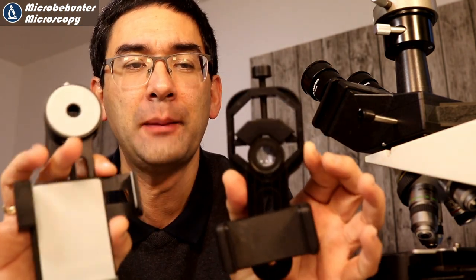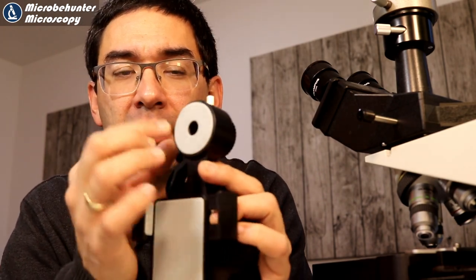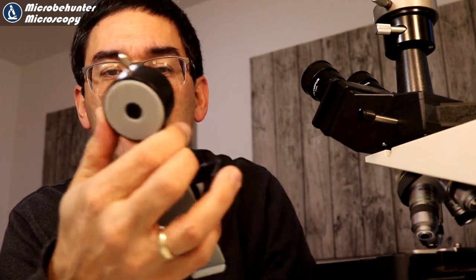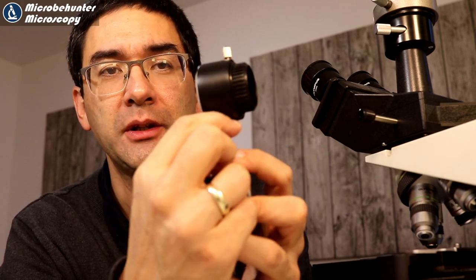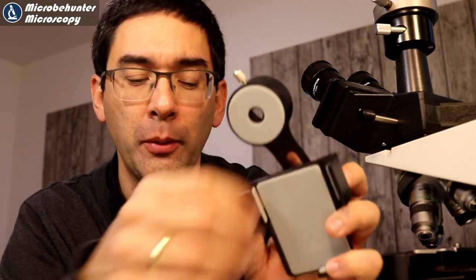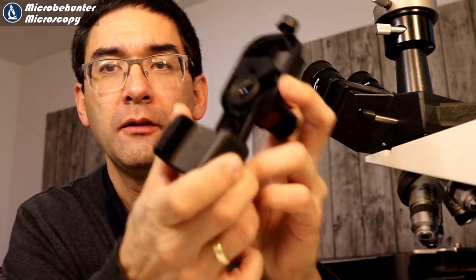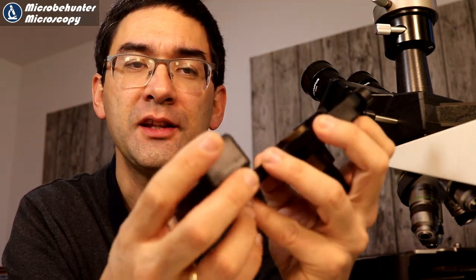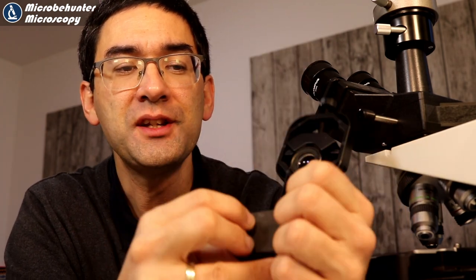So let's talk about some of the similarities and differences. The overall principle of those two adapters is quite similar in the sense that the mobile phone is held in place, and then the part that goes over the eyepiece can be positioned - by first loosening a screw in the back - in such a way that it's directly over the lens of the camera. The same is also the case here: there is a screw down here, and by moving it further up and down you can also position the eyepiece directly over the lens of the camera. So that's a similarity - the principles are the same.